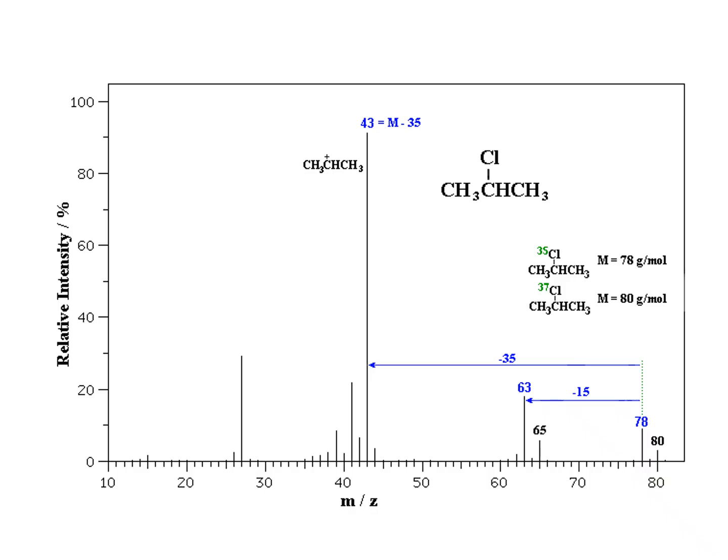When we look at our base peak, it is formed again through the loss of the halogen. And again, remember when we fragment our halogenoalkanes, they tend to form stable fragments through the loss of the halogen. So our base peak here has a mass to charge ratio of 43, and that is as a result of losing the chlorine 35. Note again how the molecule has been drawn with the CH3, the carbon with the plus sign where the chlorine was lost, the hydrogen, and then the CH3.